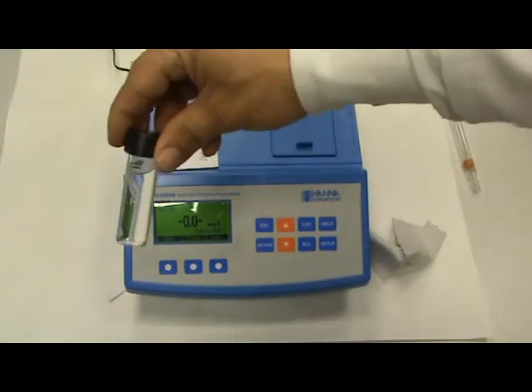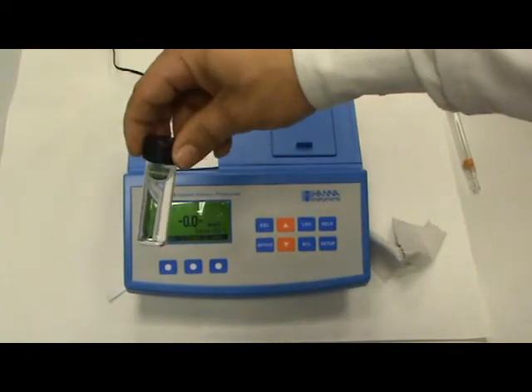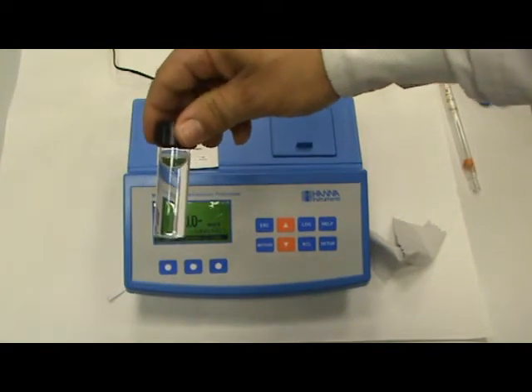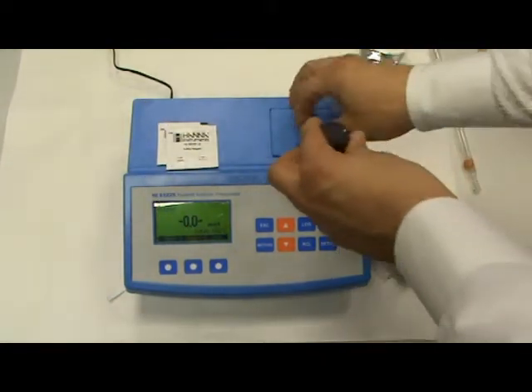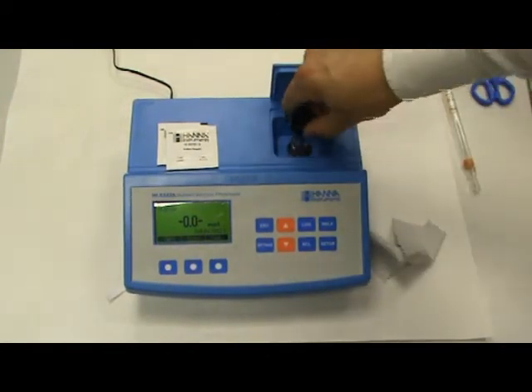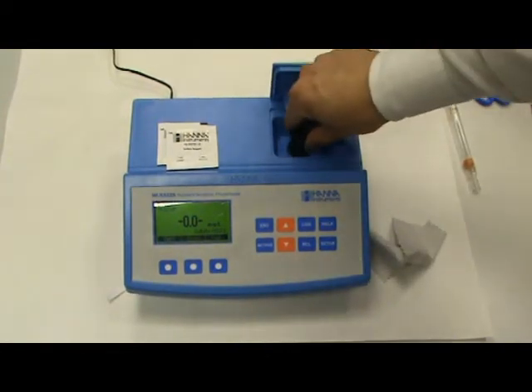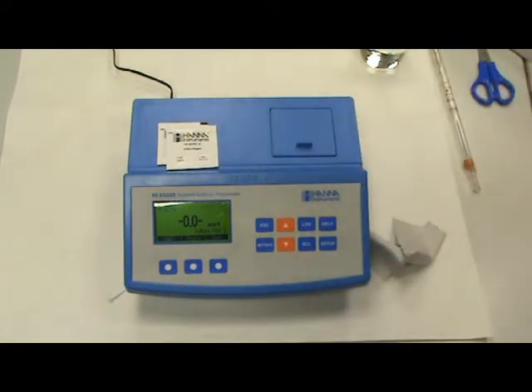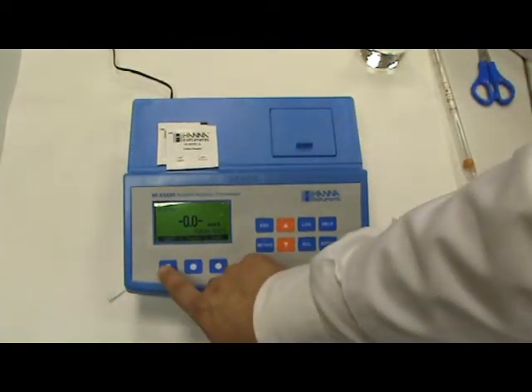Ahora lo que vamos a hacer es: hemos llenado la cubeta con la muestra con 10 mililitros. Y ponemos, para que coja el color inicial del agua, la cubeta en el equipo, siempre con el número 10 en frente del puntito azul, para que siempre la cubeta esté en la misma posición. Y pulsamos al cero.